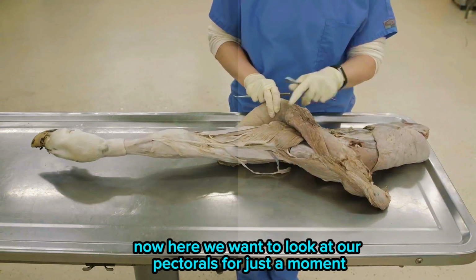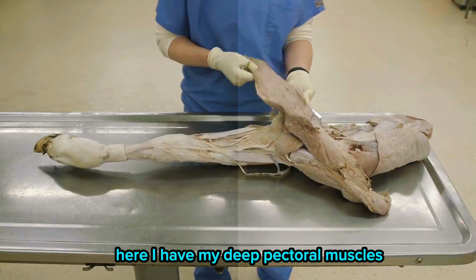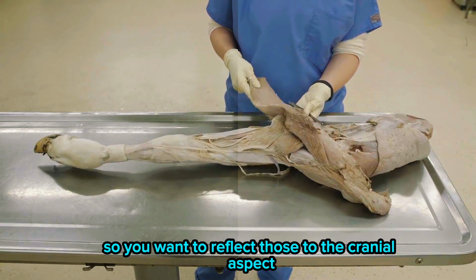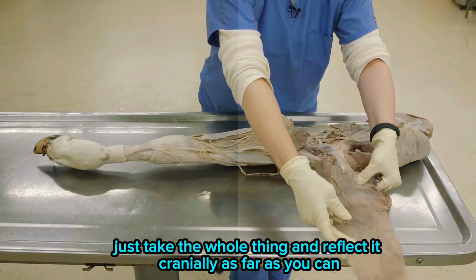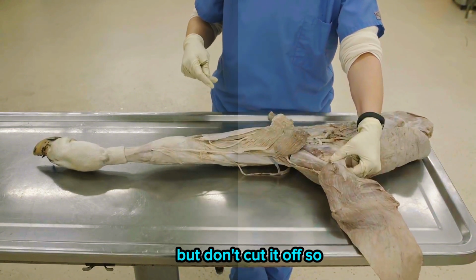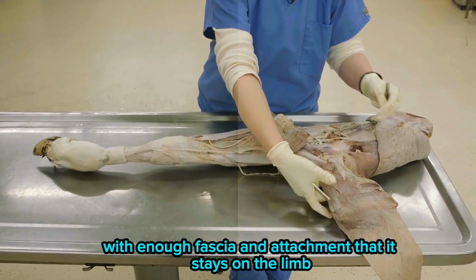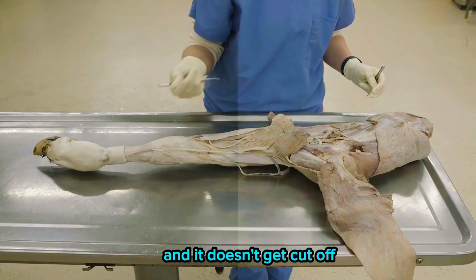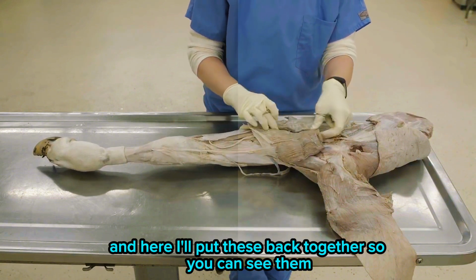Now here we want to look at our pectorals for just a moment. Here I have my deep pectoral muscles, so you want to reflect those to the cranial aspect. Just take the whole thing and reflect it cranially as far as you can, but don't cut it off. Make sure you keep it attached with enough fascia and attachment that it stays on the limb and doesn't get cut off. And here, I'll put these back together so you can see them.